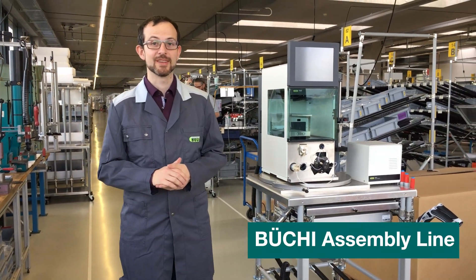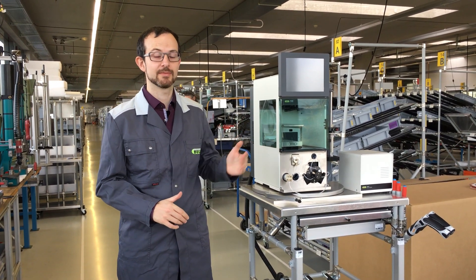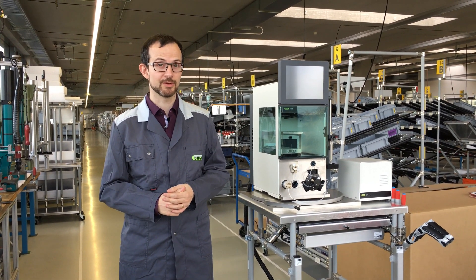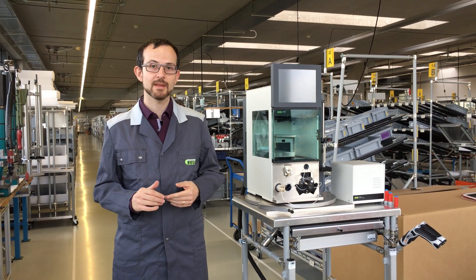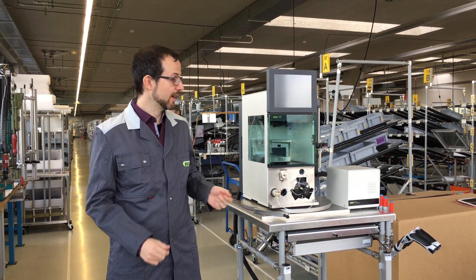Welcome to the assembly line of Buhi. We are here right in front of a brand new pure system. If you encounter unexpected results or even a failure with your device, it might be related with the application or with the system itself.